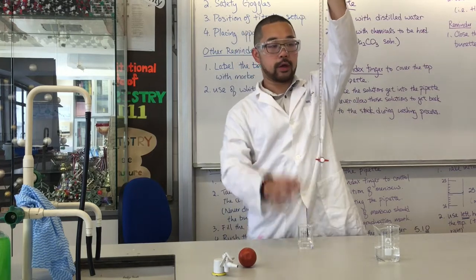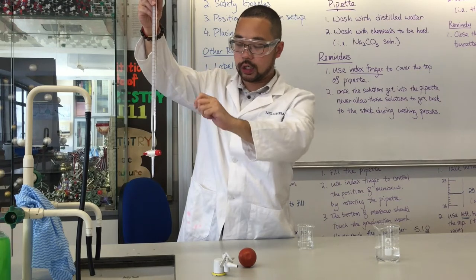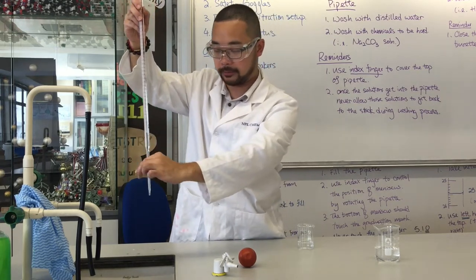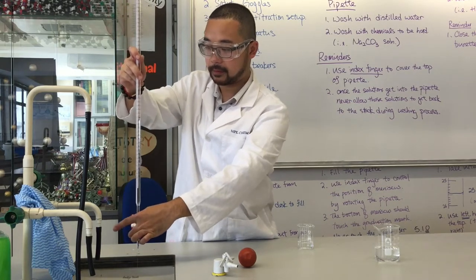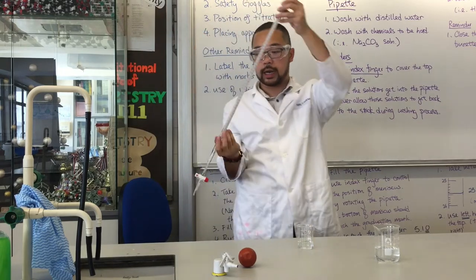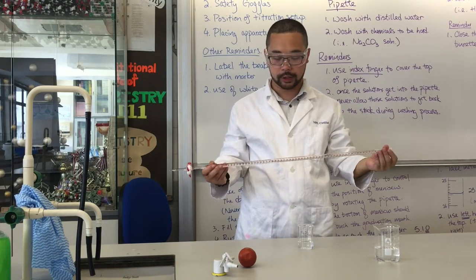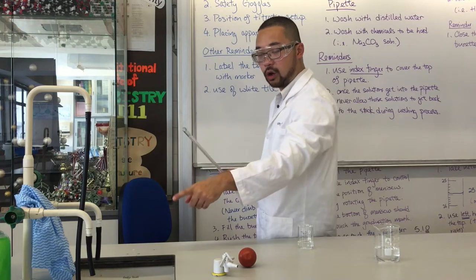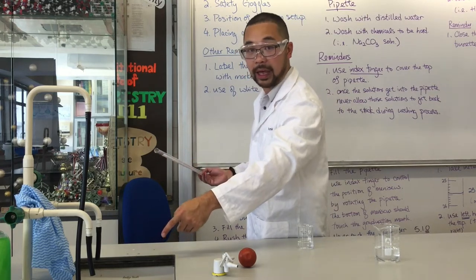Right now we fill half of it, and when you get close to the sink, what we need to do is open the tap and let the water run from it to rinse the jet part. At the same time, we'll shake it a bit. Afterward, we'll close it and do exactly like the pipettes. We place it horizontal, normally with the opening close to the sink, so that when the water flows out, it still ends up in the sink.